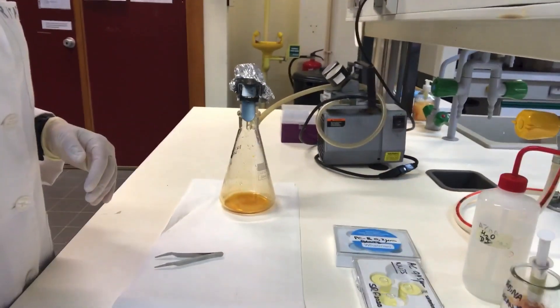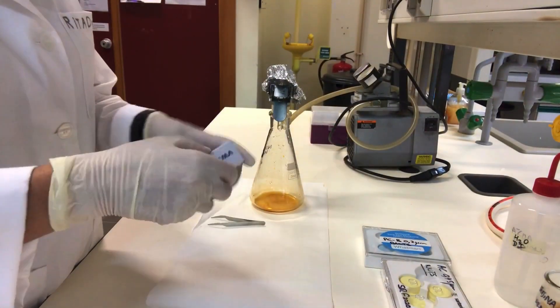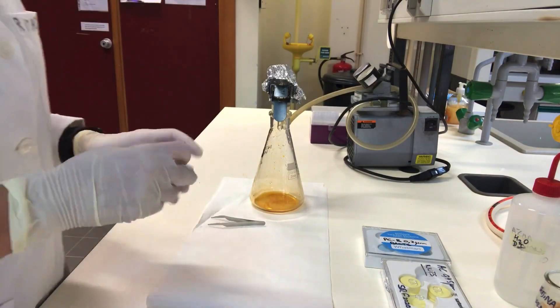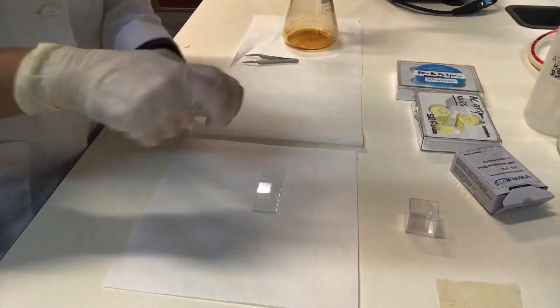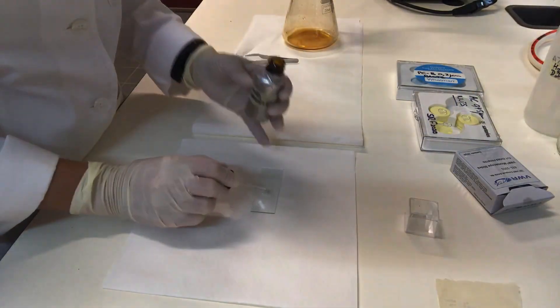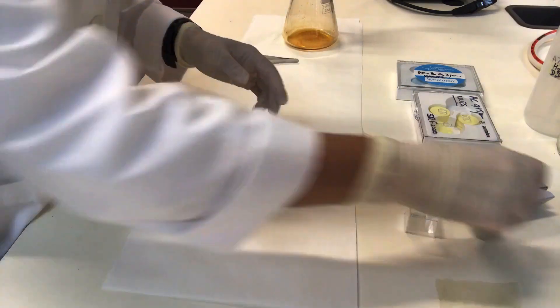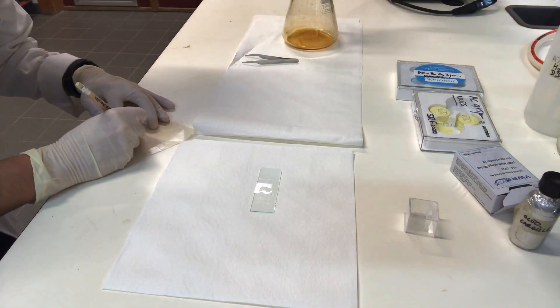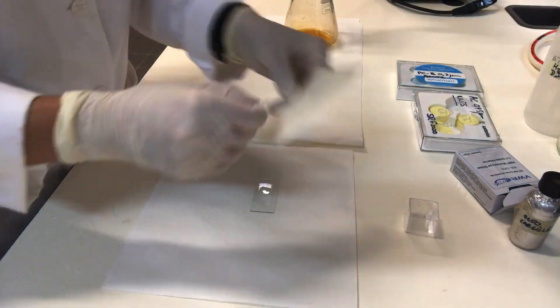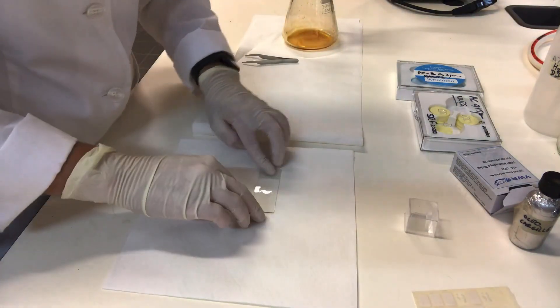In the meantime, add a drop of Immersion Oil to the center of the slide and spread it. Then write all relevant information — including the volume of filtration — on a label and put it on the glass slide.